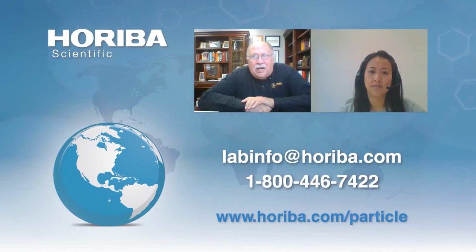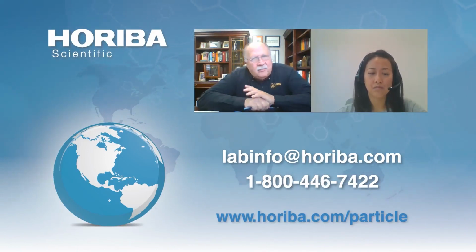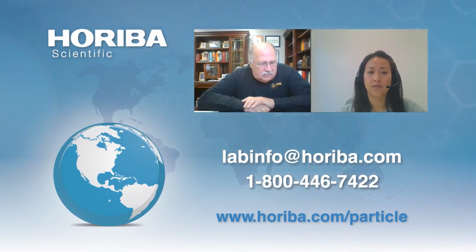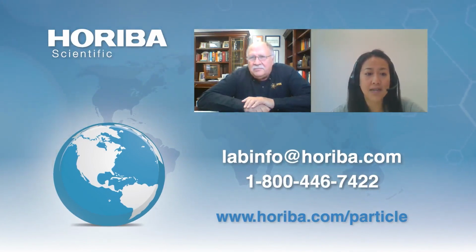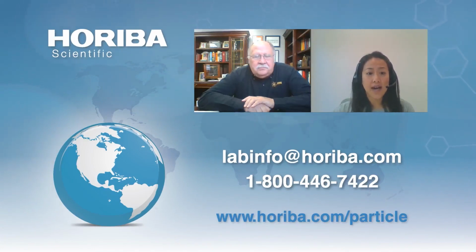So, at the end of the day, if you're really concerned about whether you're getting an accurate measure, I've heard of many people doing a freeze drying experiment and then doing an SEM image analysis as a confirmation. But dynamic light scattering is the technique to use. Thank you. And I believe that dynamic light scattering can handle quite concentrated samples, so there may be a way to go around it. Mm-hmm. I think that's about it.